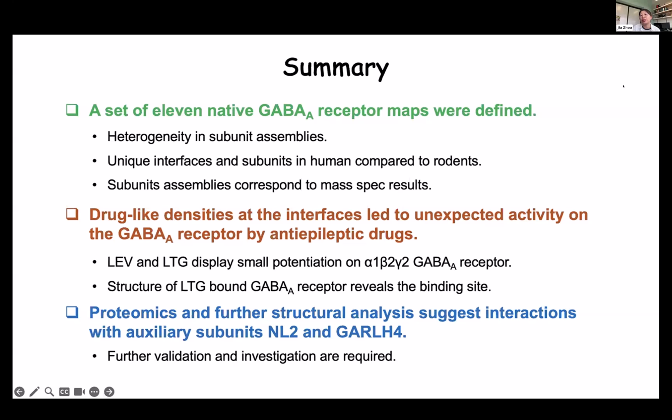Yeah, the question is about the nanodiscs. Which lipids did you use in these nanodiscs? Oh, the brain polar lipid. Okay, so it's the lipids extracted from the brain, right? From the commercial form, the Avanti brain polar lipid.